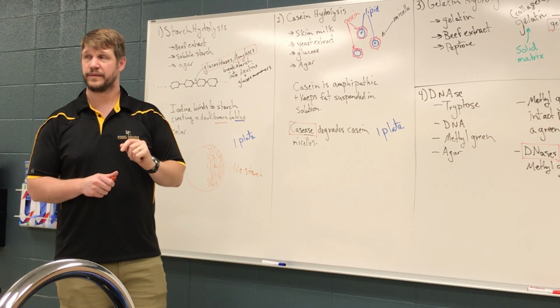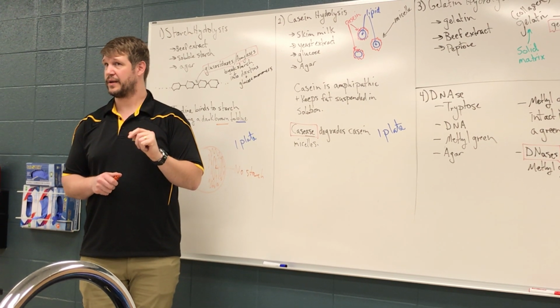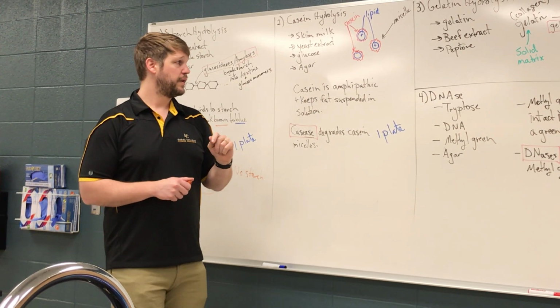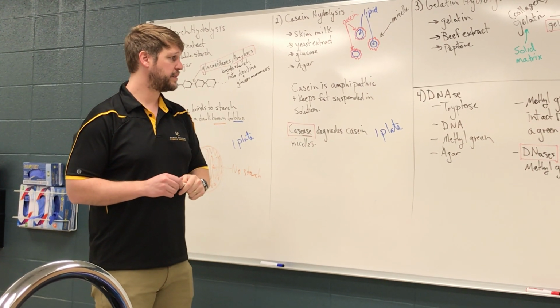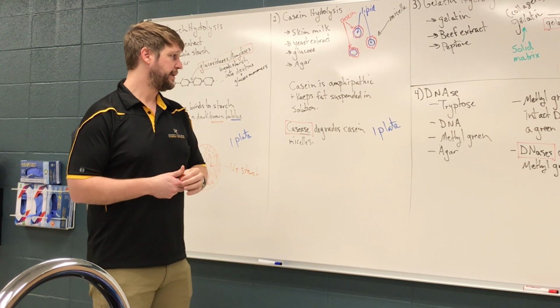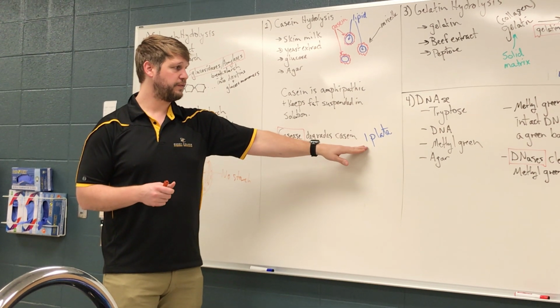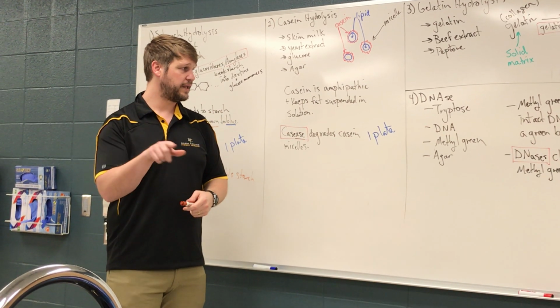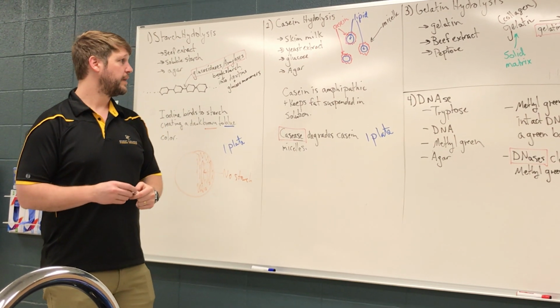Okay? Does that make sense? Right. So again, fairly unambiguous in terms of interpreting it. It's fairly easy to see whether an organism is positive or negative. Again, for this one plate, divided into 4 quadrants, that way you could do all 4 organisms on one plate.